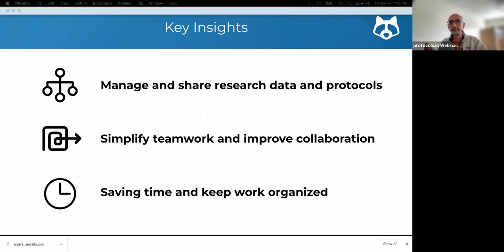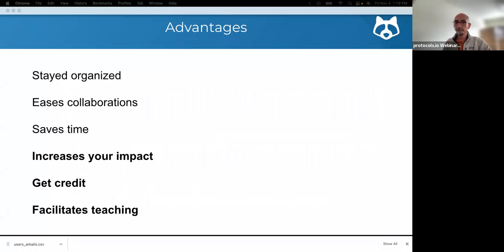As I will describe next, protocols.io can support, facilitate, and increase the quality of your research and teaching because it allows you to manage and share research data and protocols. It allows you to simplify teamwork and improve collaborations, and it allows you to save time and keep your work organized. Protocols.io is also a tool to increase your impact as a researcher, to get granular credit for your technical and methodological discoveries and innovations, and to improve your performance as an educator.